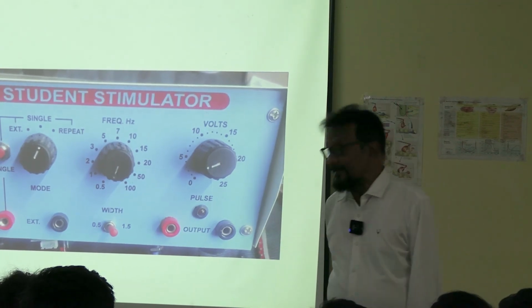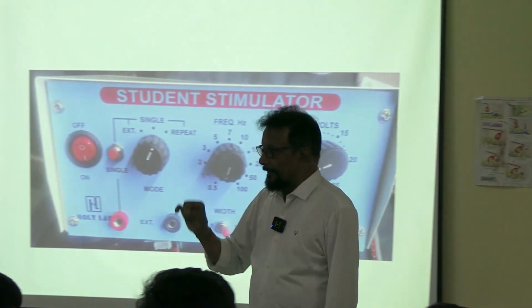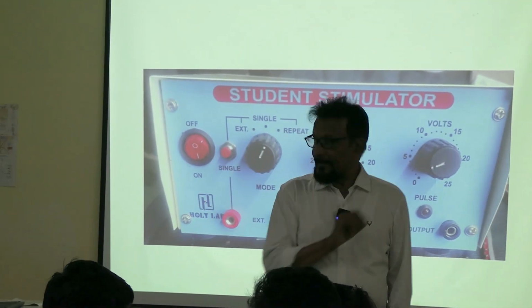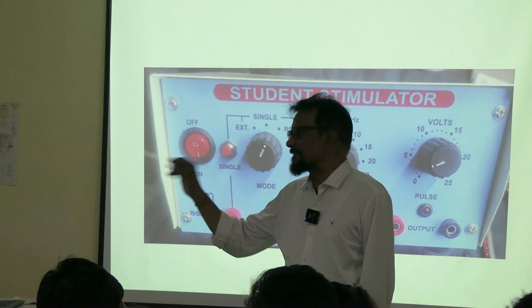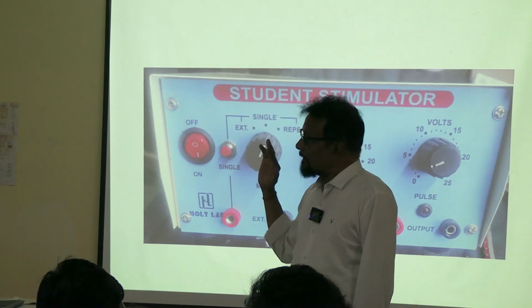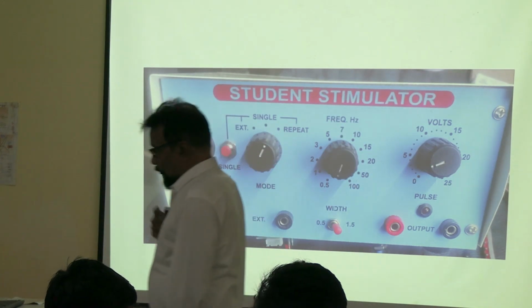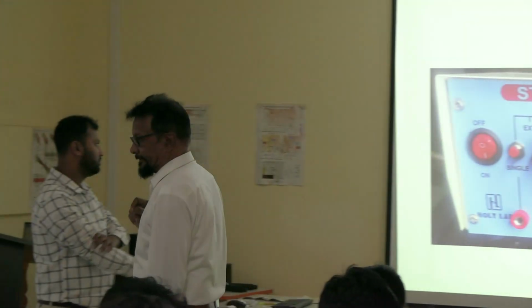And this stimulus is electrical. But we cannot give AC current, and not DC current directly either, because they can damage the nerve or muscle. So what do we have to do? We need induced current.